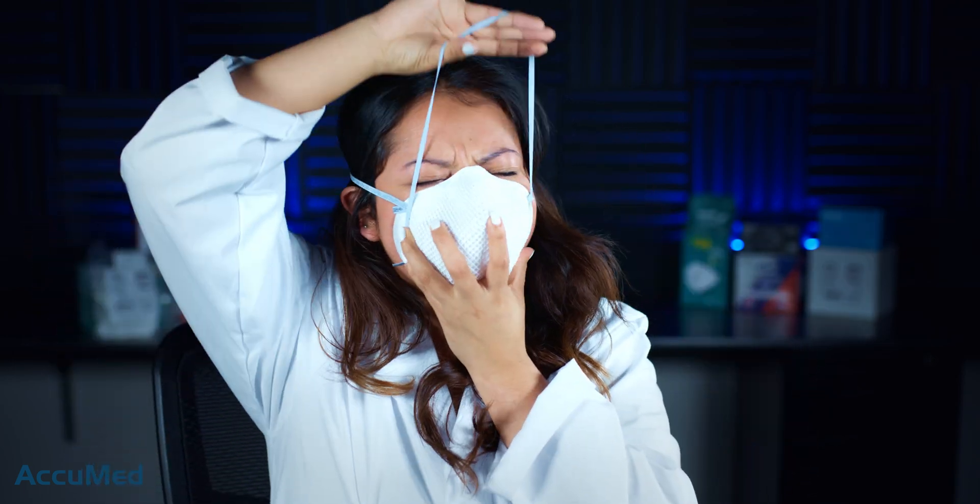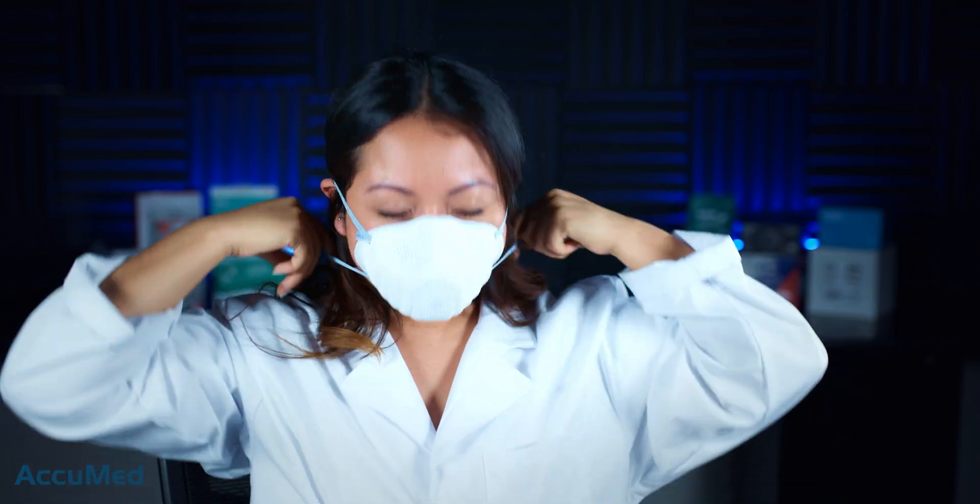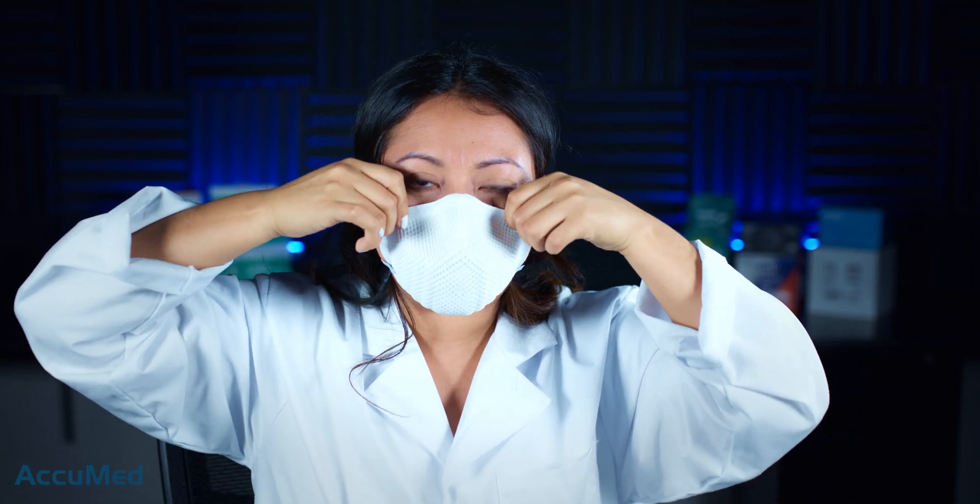Usually cup style N95 respirators are on the more tight side of the fit. So these are pretty tight on my face. But I did mention it doesn't have a nose wire. So you do kind of have to play a little bit with it to make sure that it fits your face properly. It doesn't have any strong smell. I can't really smell anything and the breathability of it is pretty good.